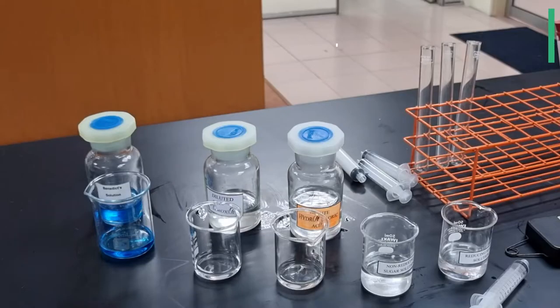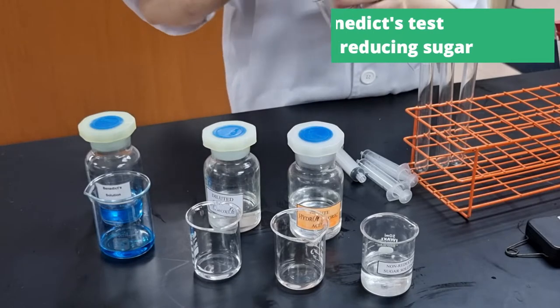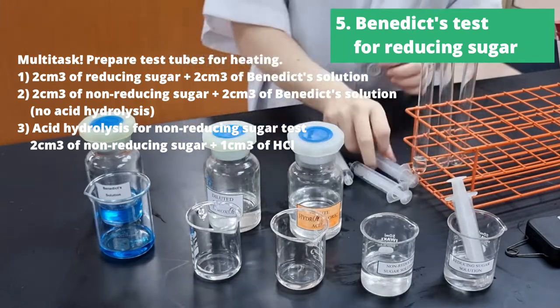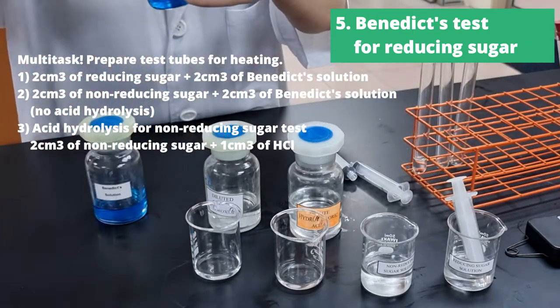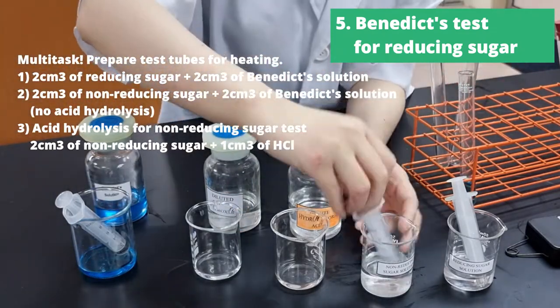Now the next part is the tricky part, because we are going to be going into Benedict's test for reducing sugar, but here's the catch — we want to multitask. We want to prepare test tubes ahead of time for heating, and we want to do not only reducing sugar tests, but also start with the non-reducing sugar test.